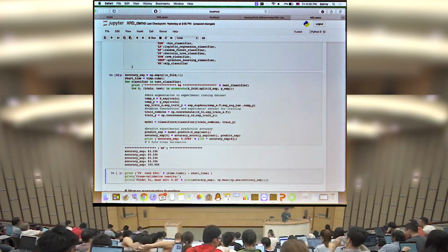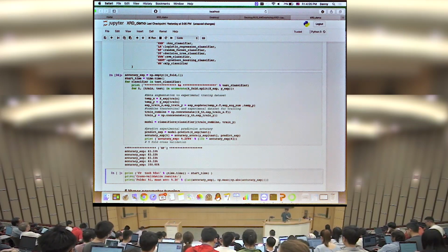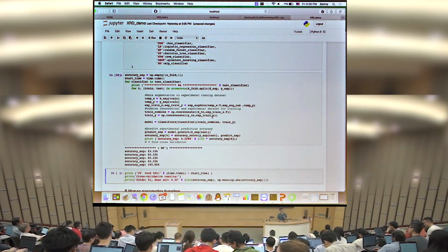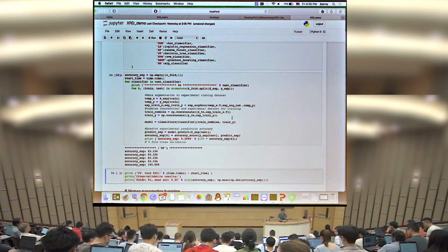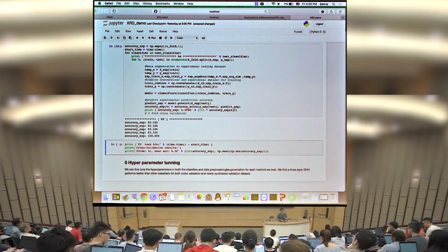So now it's printing out the accuracy of your prediction for each fold. So we can say, okay, for the first 4 folds, we get around 83.33% in terms of predicting the dimensionality of your crystal based on all this XRD spectra. The last fold is good, but potentially is biased. It depends on the way you do the data set split in your cross-validation.